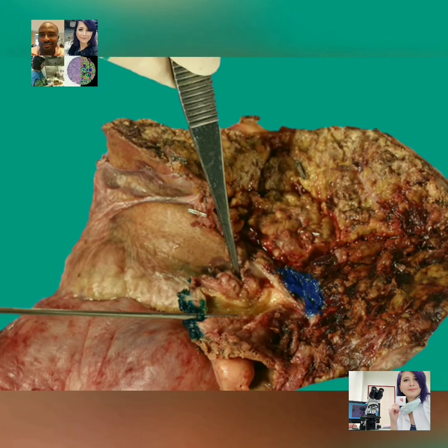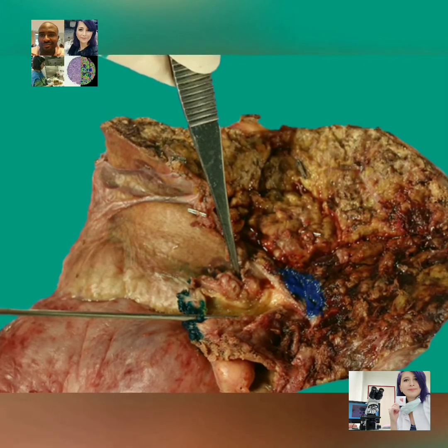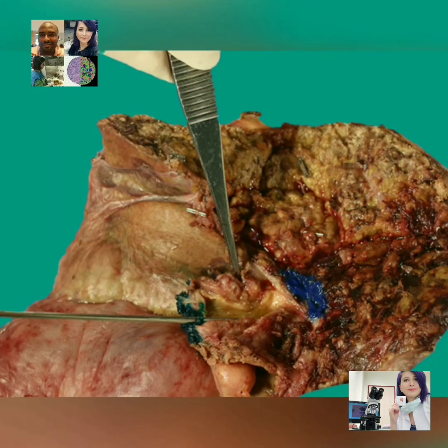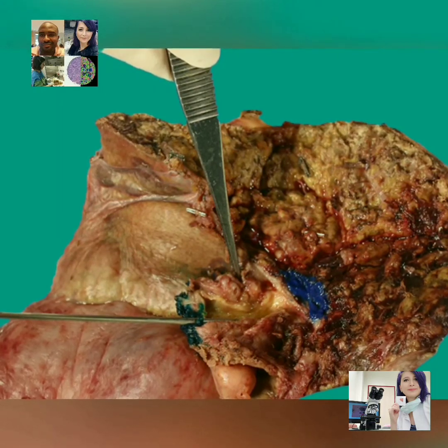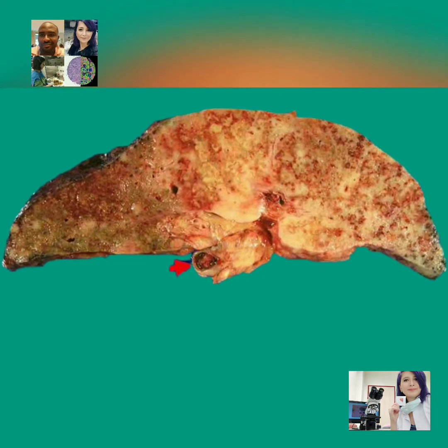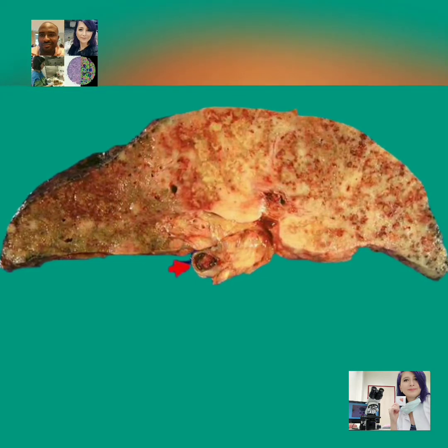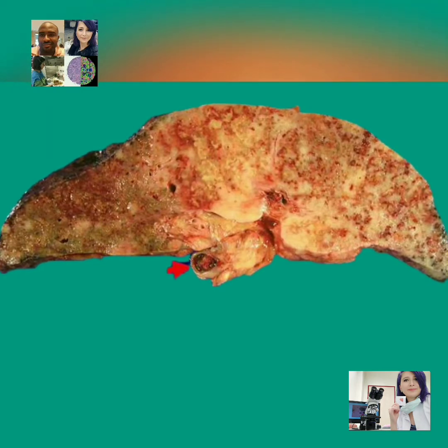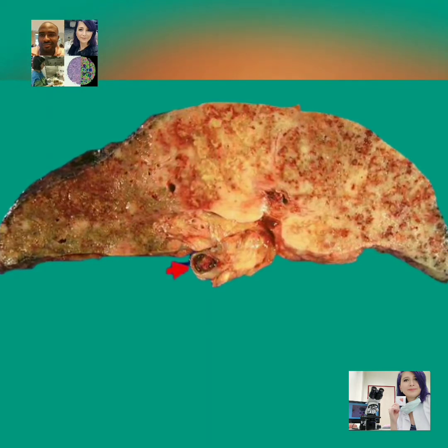The length and diameter of the common hepatic ducts, hepatic duct bifurcation, left and right hepatic ducts, as well as the cystic ducts should be noted. So next up is the weight of the liver, which is usually documented in grams. Subsequently, the liver capsule should then be examined.